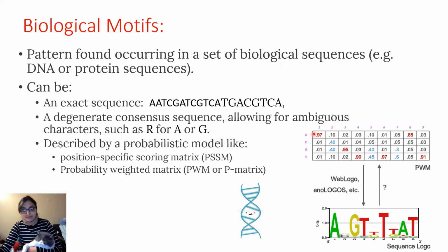And here we're selecting the highest values. If it's not too high, like I think the threshold in this image is 0.8 or something, so if one base has 0.8 and above, it's colored in red. Otherwise, it's in light blue here. And the idea is that, for instance, we have a 97% chance of an A in the first position of the motif. So in all of these sequence logos, there are 9 spots, each corresponding to this here.